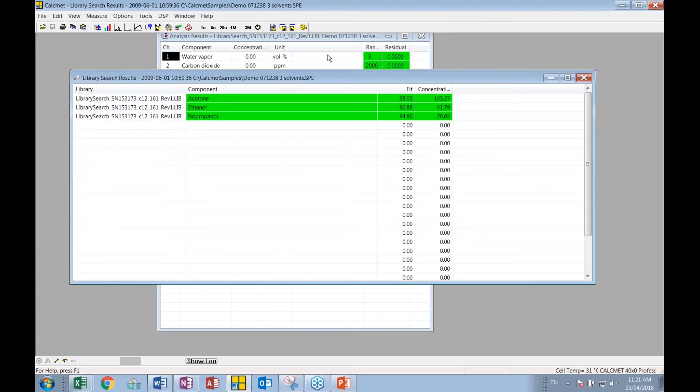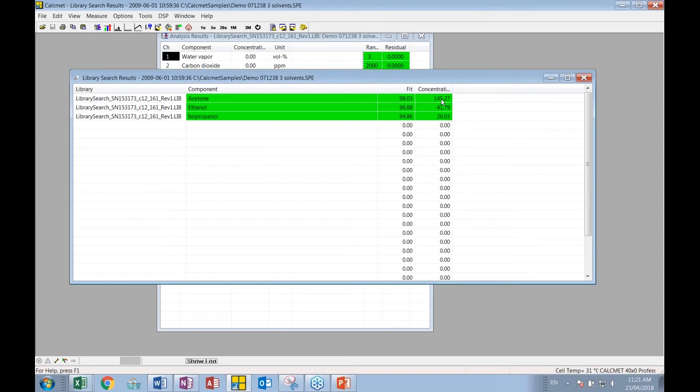Then what it's showing, the end user, is that here in this sample, it believes statistically there is acetone with a very strong 98% fit, this concentration, the ethanol in 96, 97% fit concentration, and the isopropyl alcohol, this particular fit and concentration.